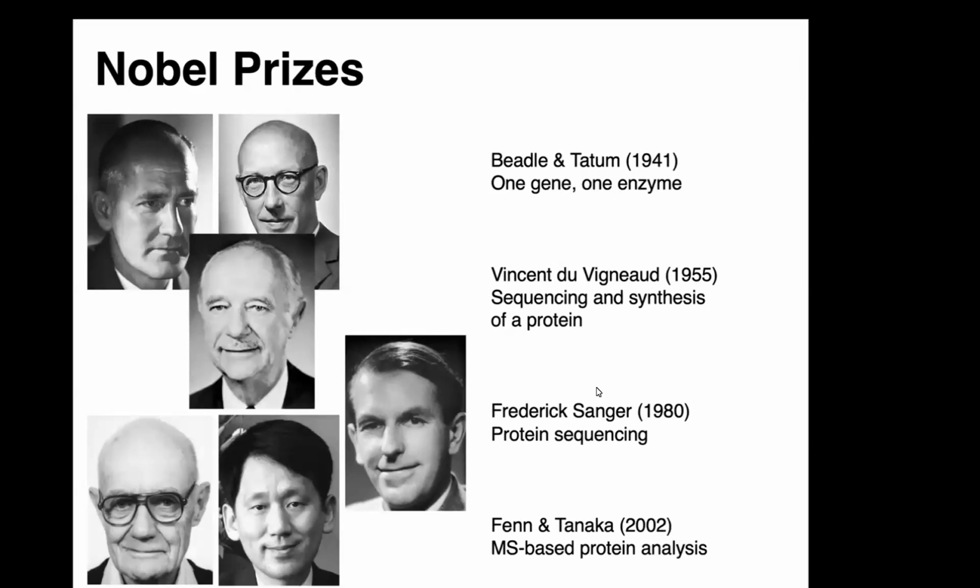And the one I always like to refer to, because basically Fenn and Tanaka both won Nobel Prizes for mass spectrometry-based protein analysis. And again, they demonstrated that you could use electrospray and soft laser desorption ionization very effectively on proteins. And it became more apparent over time that not only could you use these technologies for proteins, but also very easily for small molecules as well. And that's why we primarily use these technologies for metabolomics, at least in our lab.